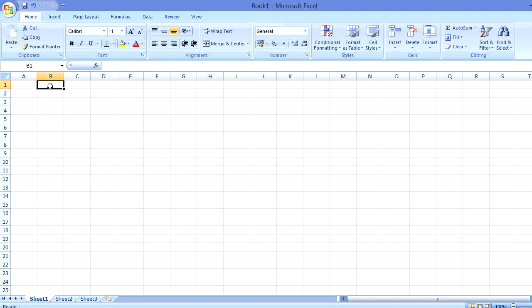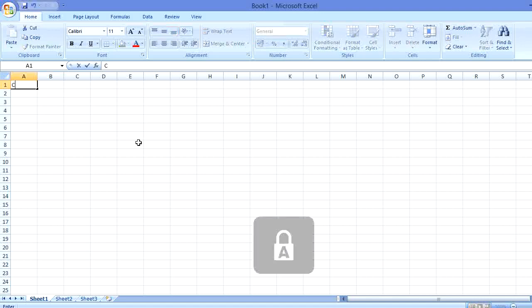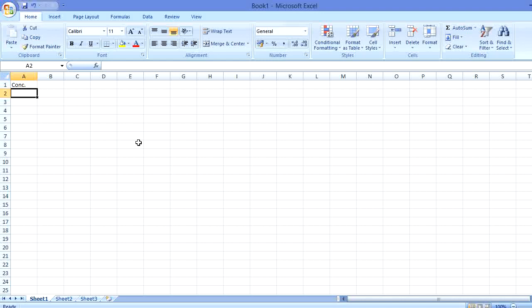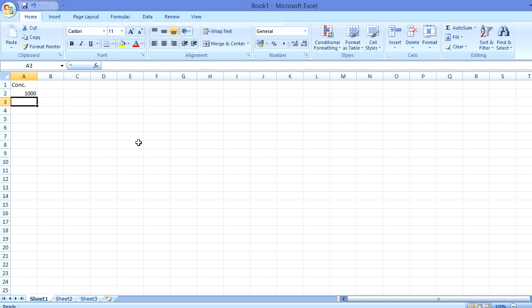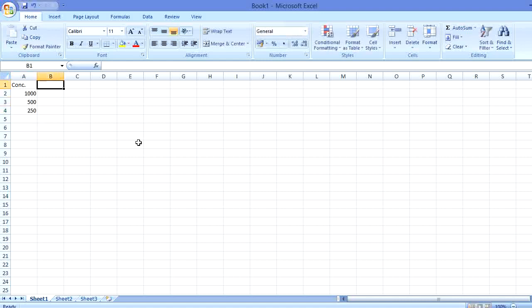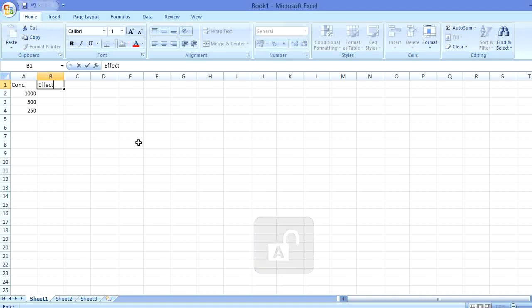For example, we have a data. In the data, there are some concentrations — from 1500 to 50. There are three serial concentrations, and this is the effect of the concentration, or toxicity produced by the concentration. We can put this as effect or toxicity.